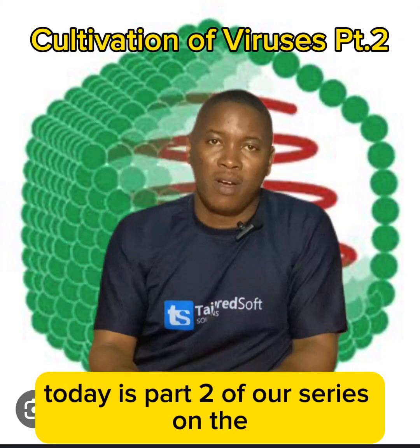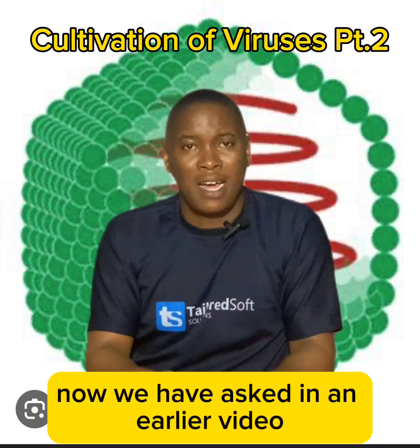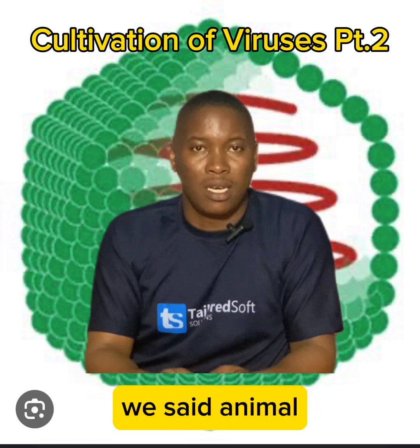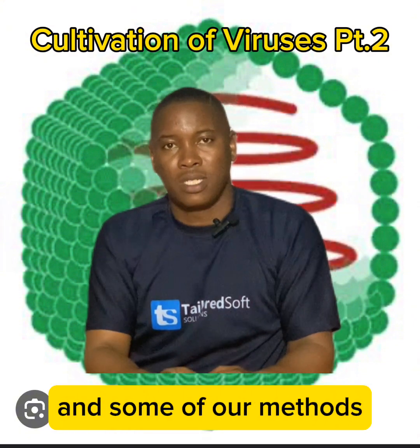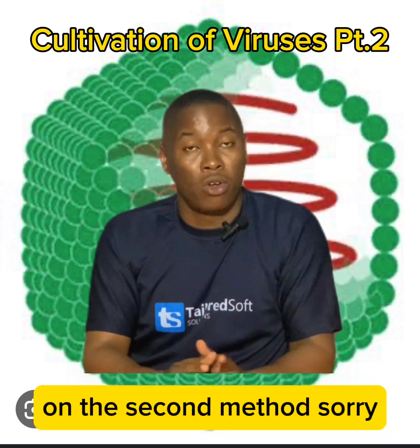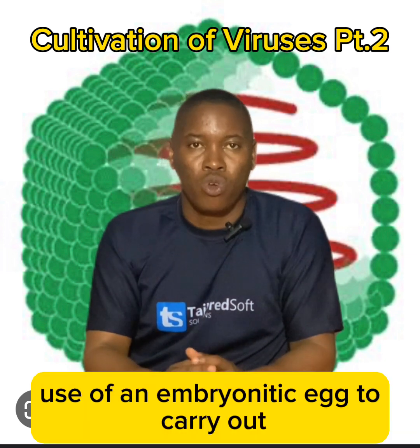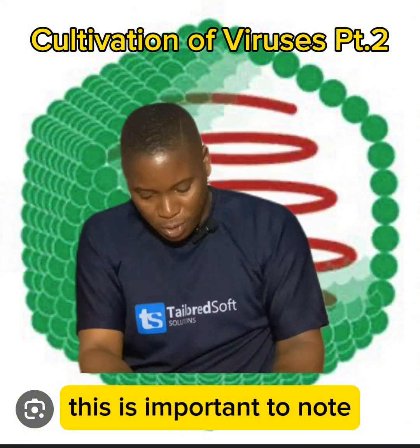Today is part 2 of our series on the cultivation of viruses. Now, we have asked in an earlier video what are the methods that can be used to cultivate viruses. We said animal inoculation, we said tissue culture, and some other methods. Now, for this video, we're going to be focusing on the second method, which is the use of an embryonated egg to carry out cultivation of viruses. This is important to note.